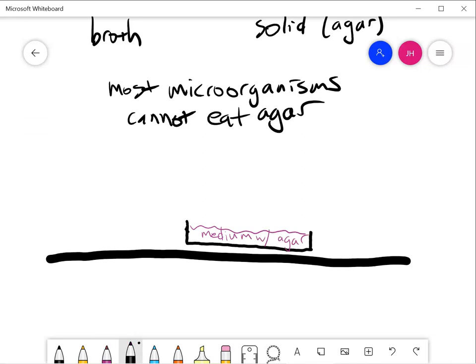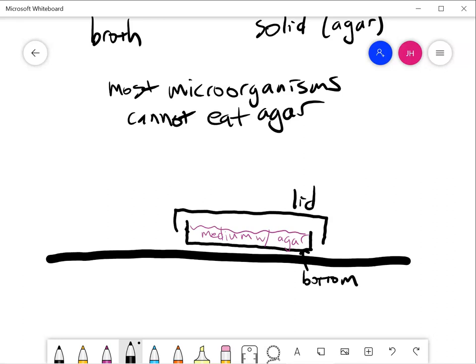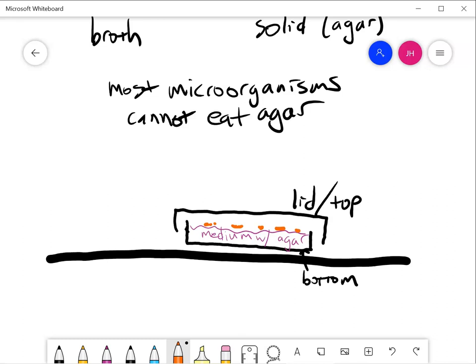And then there is a lid that goes on top. So that's the lid, this is the bottom. The idea here is that the cells are going to grow on the surface, on the surface of the agar. That's cool because we can manipulate them with tools. What the lid does is prevent dust from falling down onto the plate. So this will only have growth if we put it there.